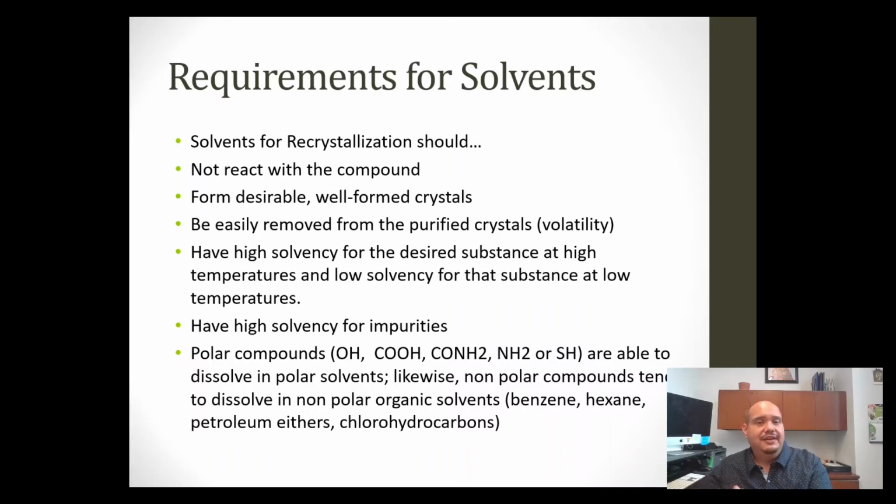When you induce more energy into that solvent and you create a rolling boil, then your solute should dissolve, but not in ice, not in cold temperature, and not at room temperature. That's very important. So it's not just about polarity or non-polarity, it's also about temperature: hot, cold, and standard room temperature. It's very important for solvents to meet all of that criteria for recrystallization.